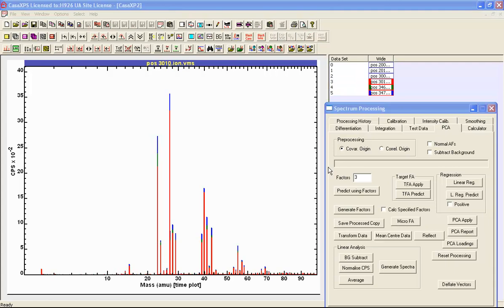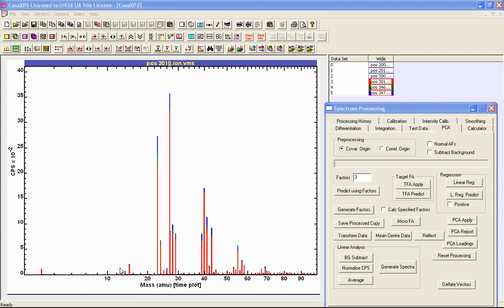There are two things we ought to do before we do the principal component analysis. The first one is to convert the data from a time plot into mass bins. As these data are displayed, these are all time bins. When a mass spectrum using a TOF system is collected, the events that are recorded are in terms of time, and we have to do a calibration to convert time to mass. However, in order to do a principal component analysis we must have data that are aligned, and therefore a calibration is important.